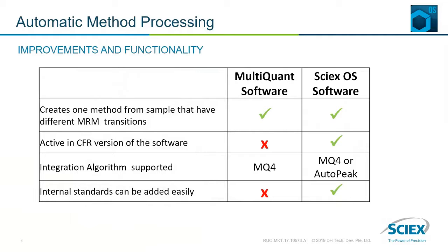Also, both MQ4 and AutoPeak integration algorithms are supported in SciXOS and you can easily add internal standards.